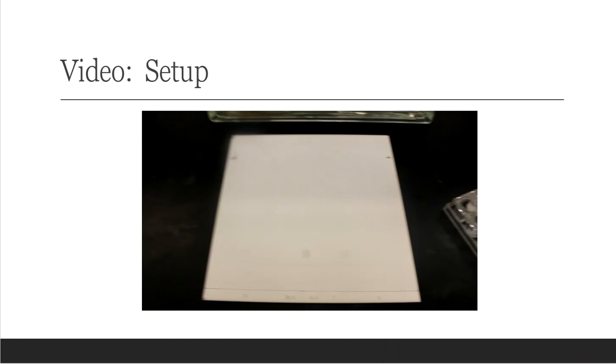All right. So again, you have to make sure that when you write on them with a pencil, you don't scrape anything off. Again, I'm going to tattle on myself because it does look like I scraped a little bit when I wrote the A here. But that's okay. Hopefully that will not interfere with my spot as long as my spot goes there. All right, so let me show you a video of what we've done together at this point because you might be able to see it a little bit better for those different types of visual learners that we have in our class.